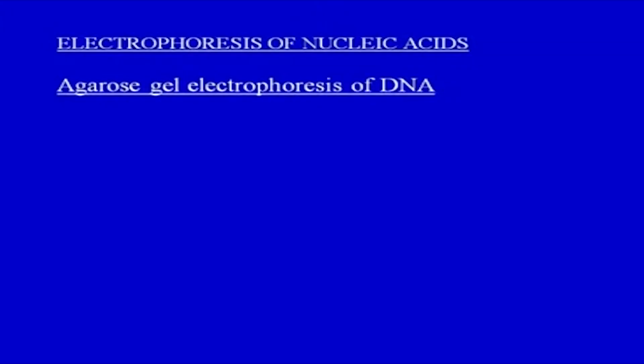in this lecture, we are going to discuss electrophoresis of nucleic acids, and here we are going to discuss various techniques which are used in the analysis of nucleic acids. Now, nucleic acids means DNA or RNA, and mostly it is the DNA which is utilized.